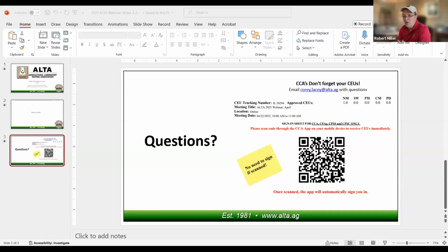Now, why is this important? Corey elaborates the fact that all of our soil testing business is done on a 2 millimeter minus using a flail mill. And the problem with the flail mill is it just beats these soil aggregates down until they flow through the screen. And I can tell you, I've been in many labs that do this on an automated basis, so to speak, and they may discard 10% of the sample that just doesn't go through the screen. You know, it's either very coarse sand or it's approaching gravel or aggregates that just don't pulverize within a 30-second time frame.